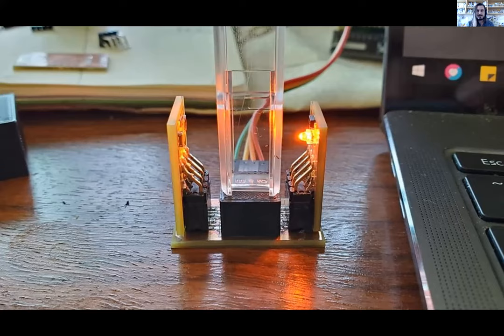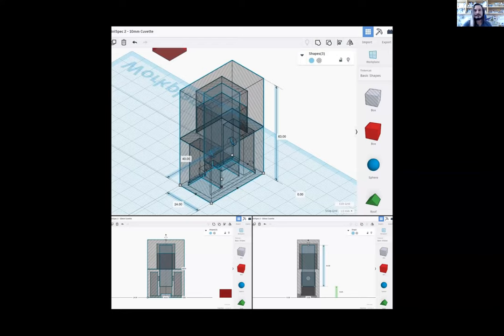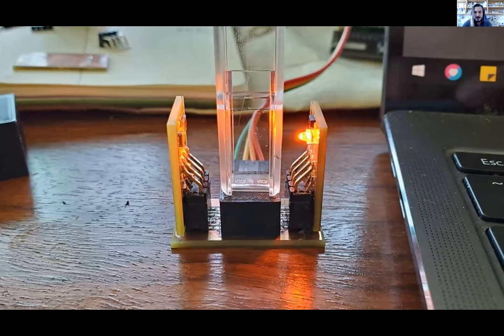So essentially the design is a light sensor, with an LED passing light through it. I decided to make a casing for it. Here's an image of Tinkercad. Super simple. Just make some cutouts in order for the two sensor pieces to slide on. And I thought, because we have this monochromatic LED, and LEDs come in many different wavelengths, what if you make it modular? What if you could swap out the LED manually and then take apart the device, swap out the LED unit, and replace it with something else, and now you have a different color. Let's say instead of 600 nanometers for optical density, you do 450 nanometers for Bradford assays or whatever. You can literally lift the two components off, the light sensor and the LED, and swap them with whatever you want.